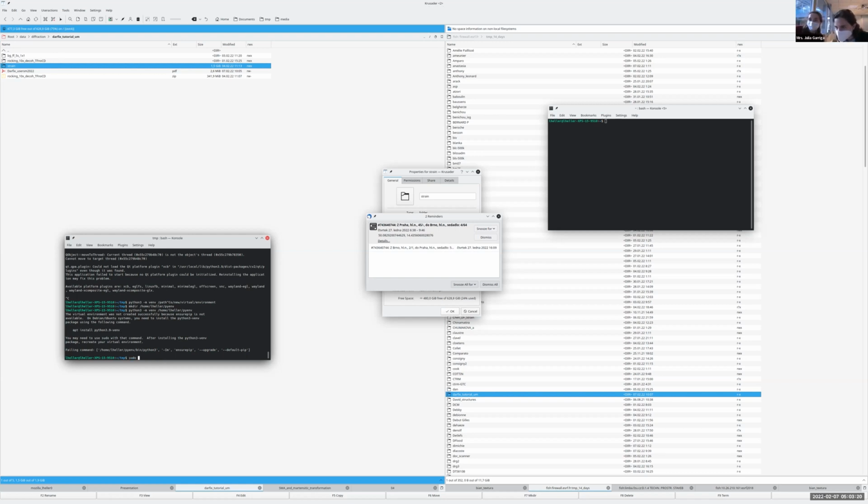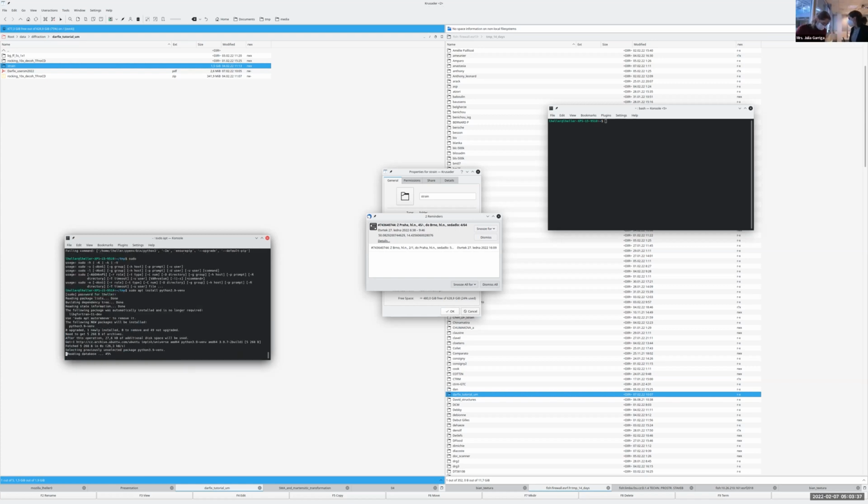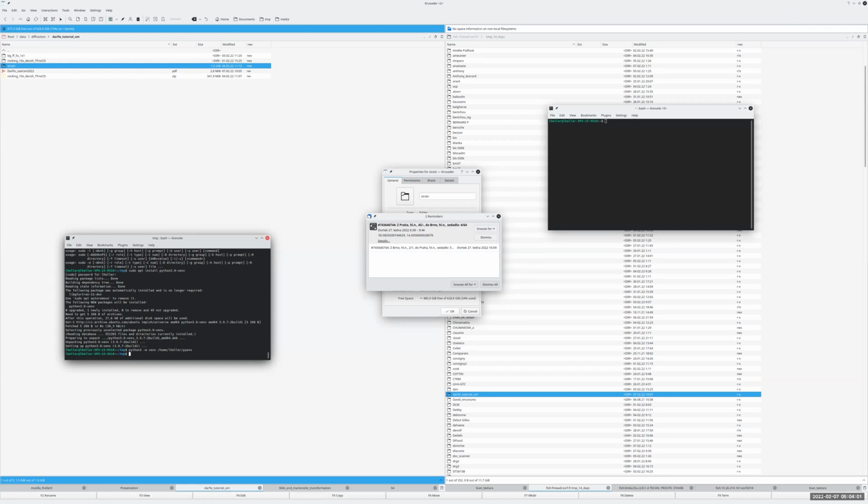Okay, sorry. Now you have the, oh, that's good. Which version of Python do you have? Do you know the version of Python? Do you have 3.9? Okay, no worry. Actually, this is very good, because I don't know how big everyone sees the console on their screens, we see it pretty small here, but it's a good installation-from-scratch tutorial on Linux. At the end, if we just run the workflow and anyone knows a problem, it would be finished in 5 minutes.